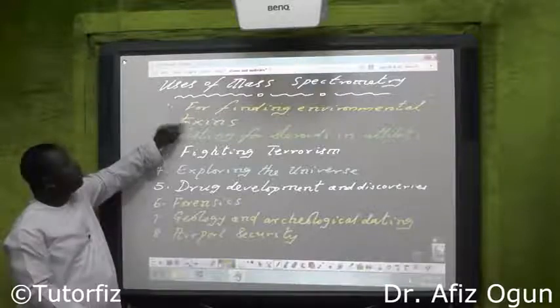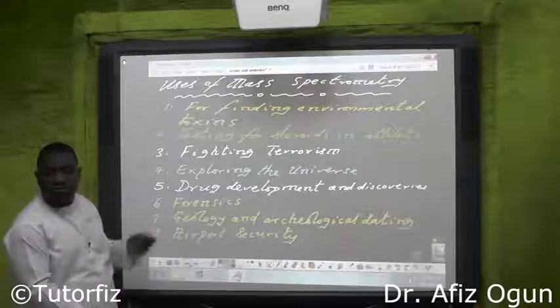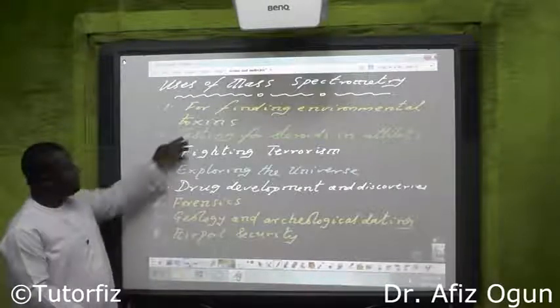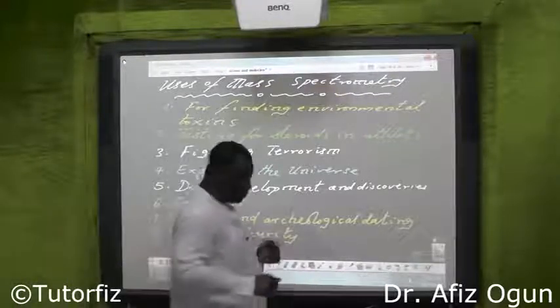If the toxin, the pollutant, you want to know what is responsible, what is in the pollutant, what toxin is causing this sickness or this death. Testing for steroids in athletes.